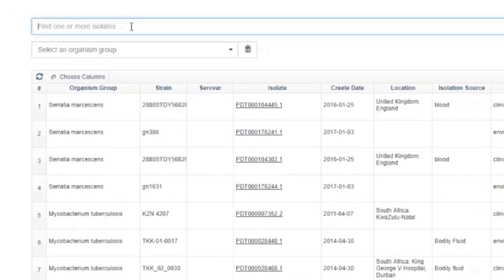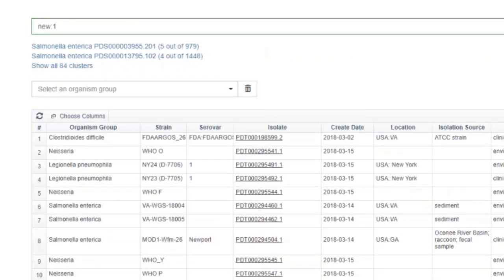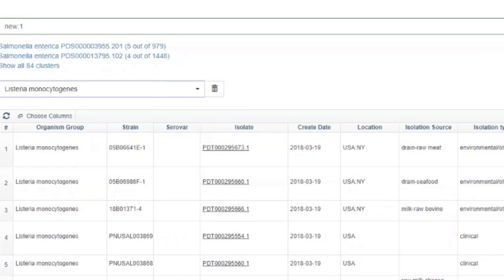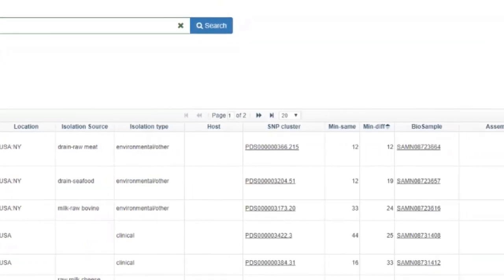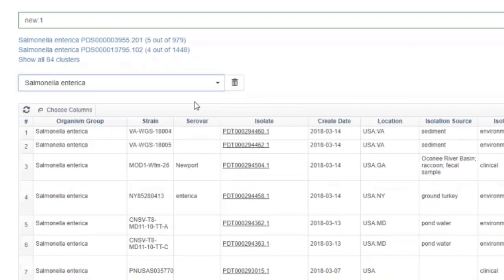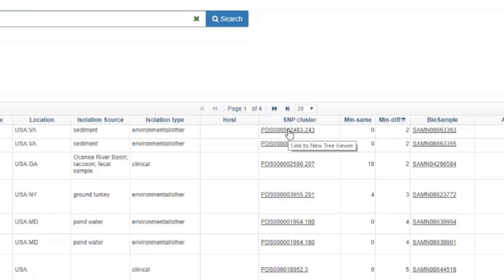I'll do a search for the new isolates. Sorting and focusing on Listeria — there are 22 new isolates. Here's an isolate that's 12 SNPs away, and that grows. These SNP distances might be sufficient for someone in a public health lab to determine they do not need to do further investigation. Switching to Salmonella, we're getting down to two SNPs — a sediment isolate from Virginia that is two SNPs away from a clinical isolate.